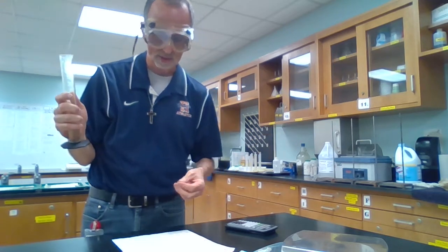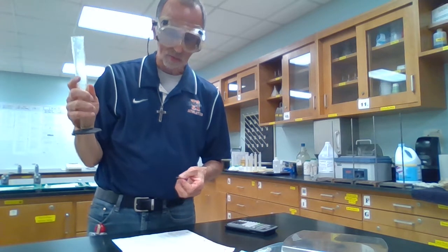There again, about 1.2 mLs. It's kind of in between 0.2 and 0.3, but it's not quite halfway, so I'm going to go with 0.2. So far, I'm right on from the last time, which is good. I was kind of hoping it turned out that way, but you never know. Error, right? Always error in measurement.